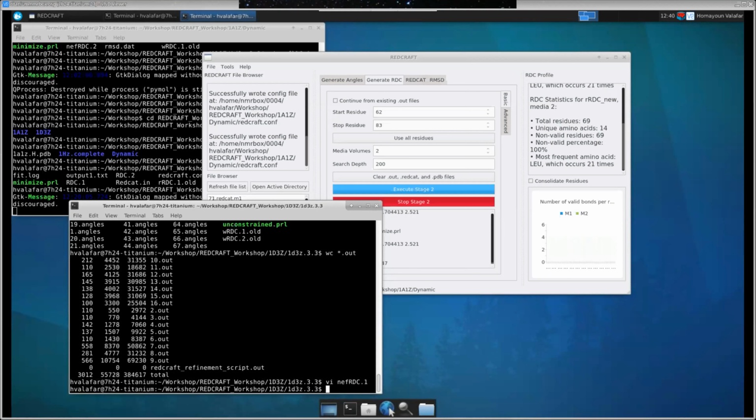Could you achieve that back and forth transfer by the minimization script option? Sort of, yes. The minimization, meaning the one that I am showing here. I think it's in your advanced option box. You have 3 check boxes, and the third one is... Right. That minimization is meant to be essentially a gradient descent based optimization purely based on residual dipolar couplings.